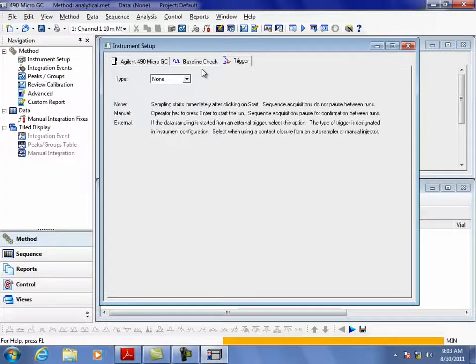Well, if we're going to do air, why don't we just run the pump and pull it out of the air? That's okay. But that's the reason we have a trigger built in. Even then, you wouldn't want that, because you just make your injection and I'd still probably run the pump even though you're doing a syringe injection. How are you going to do a syringe injection on this? I need to understand that a little later as well. We don't know. Bert told us a little bit.